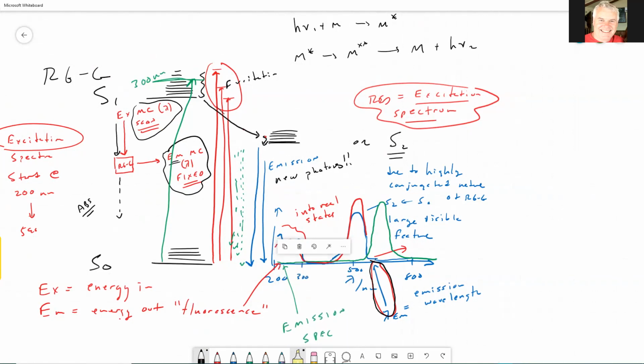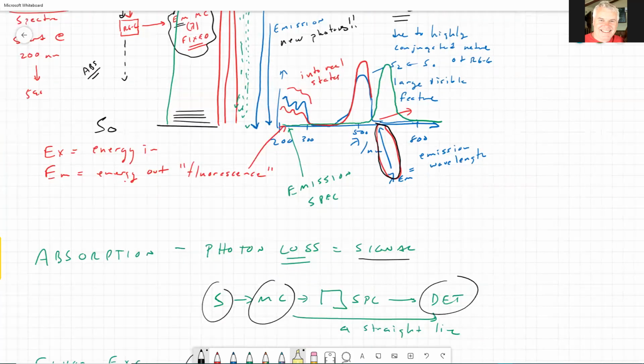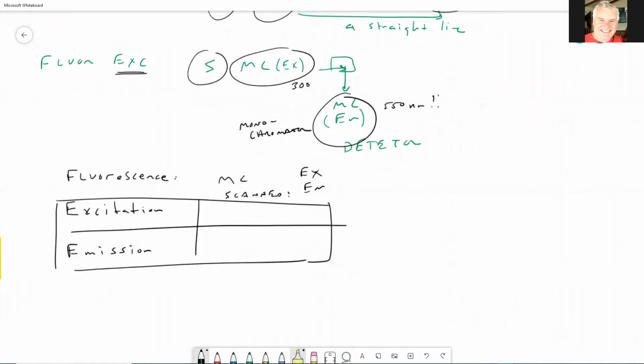And you go through a range of wavelengths where you produce some peaks, and you go through a flat range in here, and you go through another set of overlapping peaks here, and then you stop, right? Because you can't scan over the emission line. Yes, exactly. Leo says EX for EX, EM for EM. That is correct. So this is EX, this is EM. Good.